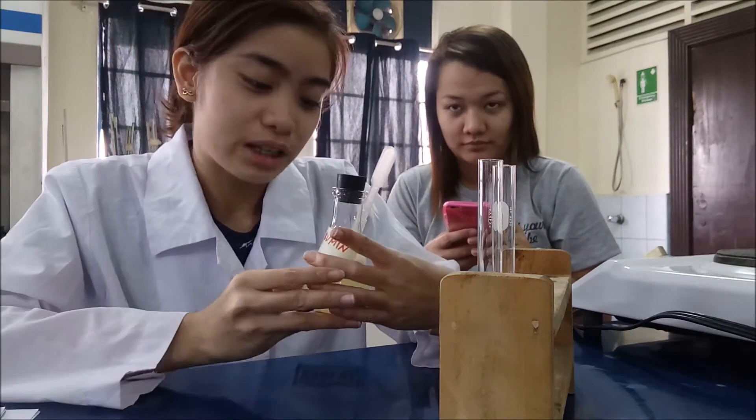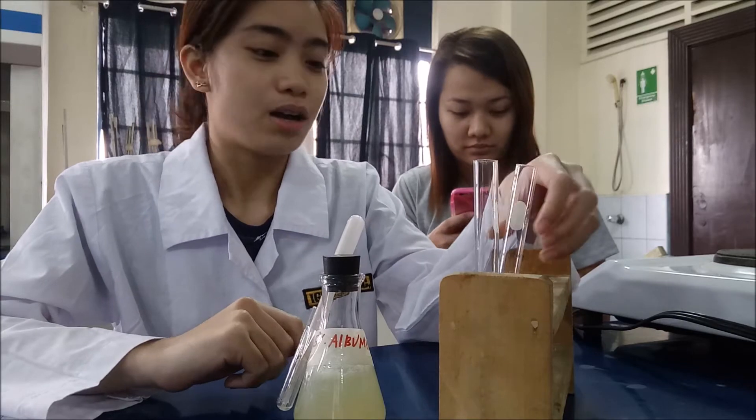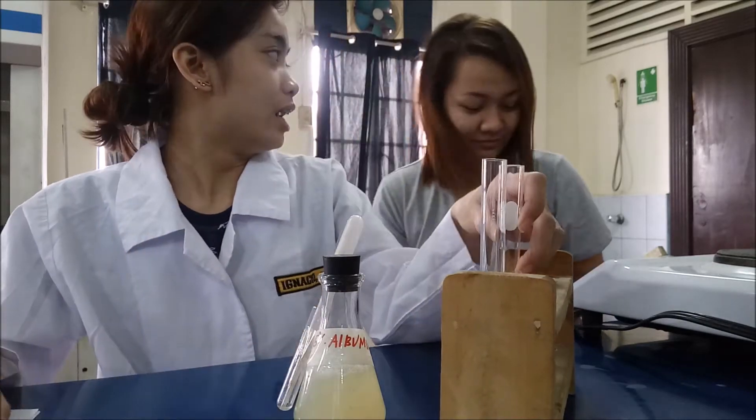So for the second experiment, we need 2% albumin to put in separate test tubes.